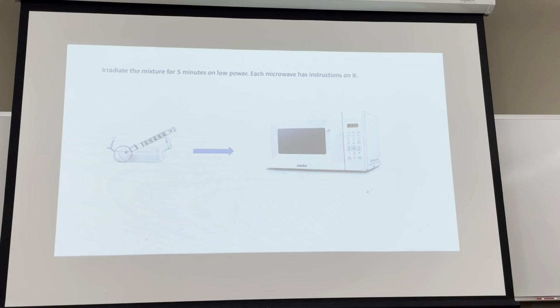But you'd construct a volcano and then you had some baking soda and then they would pour in colored vinegar and it would erupt, because baking soda and vinegar creates a whole bunch of carbon dioxide. Well, that's exactly what you're going to be doing as you pour this bicarbonate solution into your sep funnel. So, two things about that.